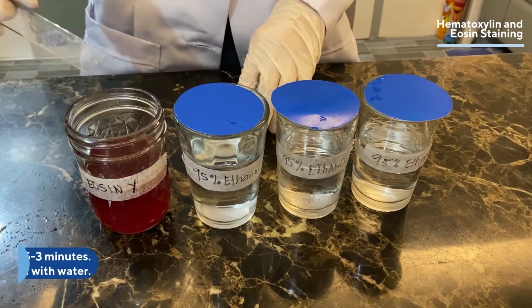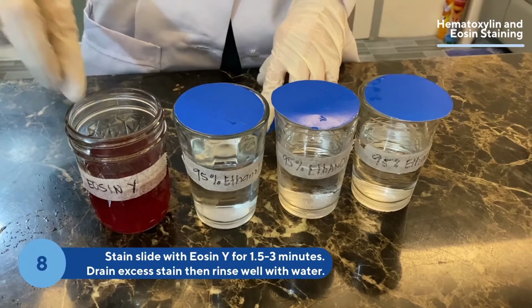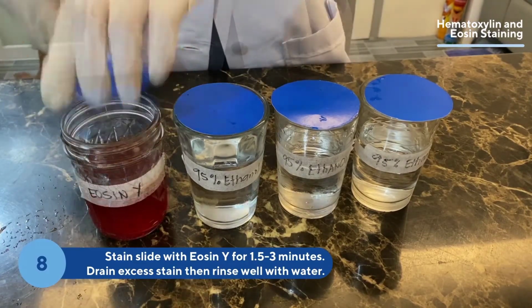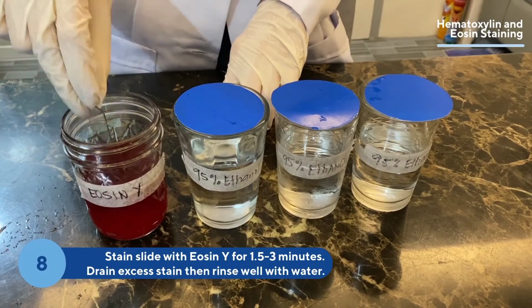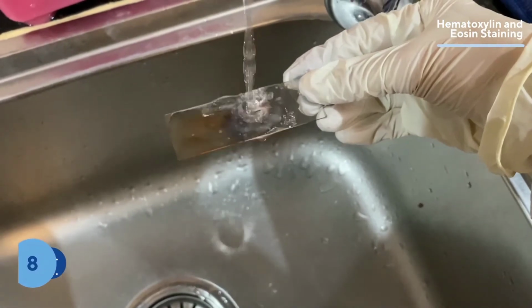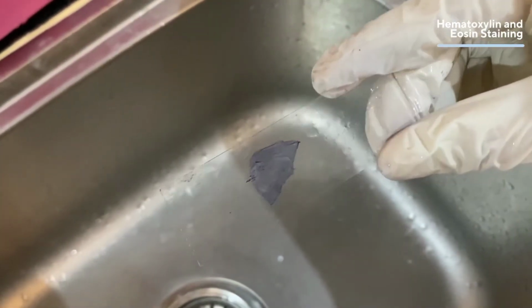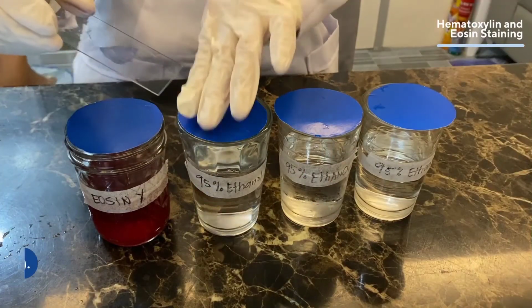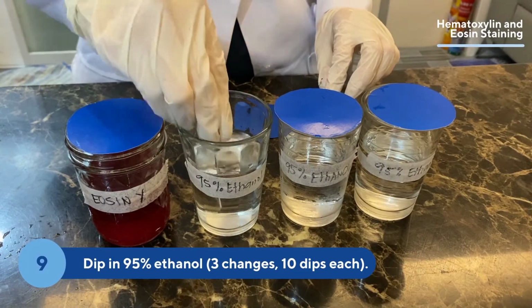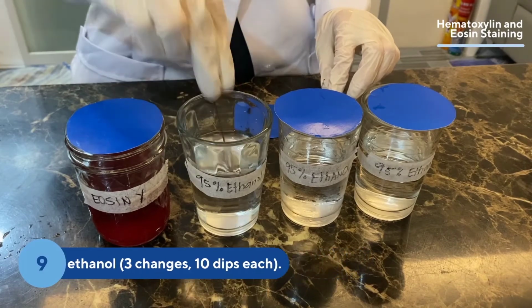And after we rinse it with the running water, we will stain the slide again with Eosin Y for 1.5 to 3 minutes. And after that, I will drain again the excess stain and then rinse it well with water. Second to the last procedure, I will dip it in 95% ethanol with at least 3 changes and 10 dips each.